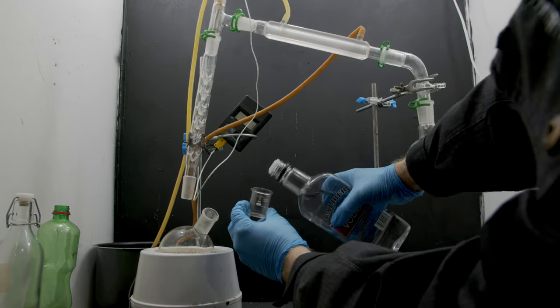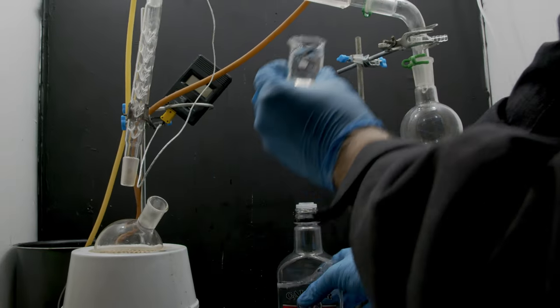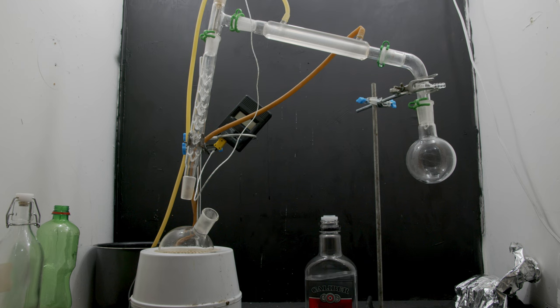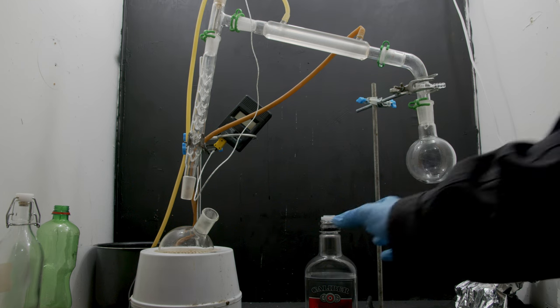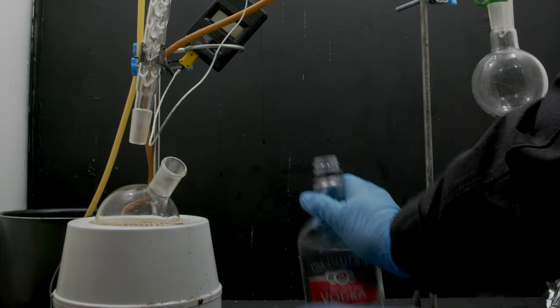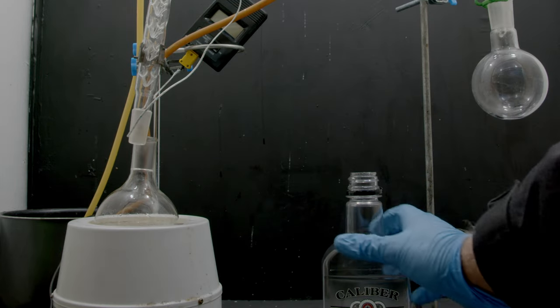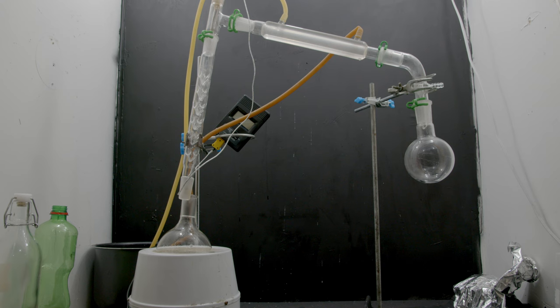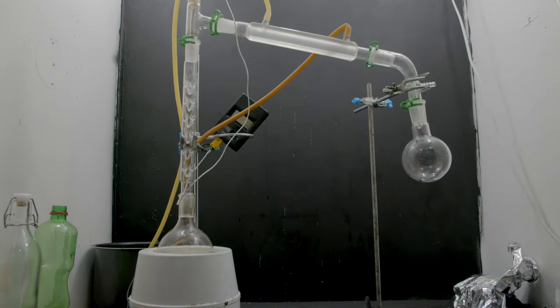Alright, so to start this off we pour like 20-ish milliliters of vodka, and then we take the cap off the top of the bottle and we just pour it in. We then add a stir bar and we close it all up. And now we can start distilling the alcohol.